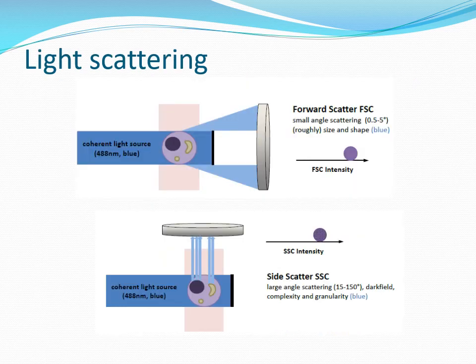Now when the cell comes in the path of the laser beam, it scatters this light. This scattering is in all directions, and this scattered light is detected by different types of detectors. You may say that this scattered light can be broadly categorized into two categories. One is the forward scatter or the low angle light scatter. It is the amount of light that moves in the forward direction as the laser passes the cell. It is refracted by the cell in the flow channel and then continues along the light path, that is the same direction that the light was originally traveling.